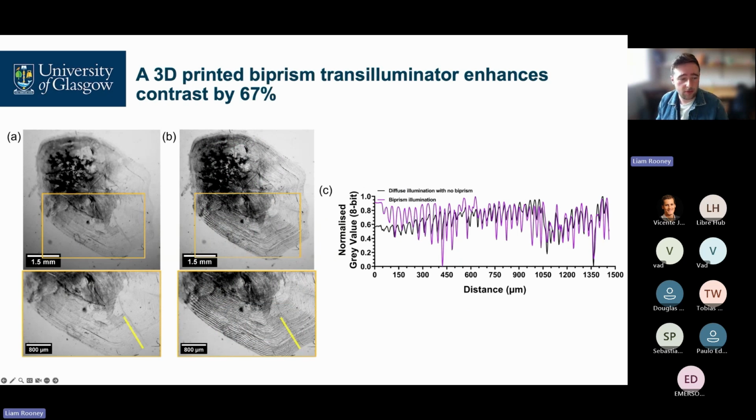And so we turned to look for specimens that are transparent, but they have some refractive structure in them that we could resolve. And so what you're looking at here is the scale from the surface of a goldfish. And these are really beautiful structures that have concentric rings that are kind of like rings in a tree that tell the age of the fish or the scale.